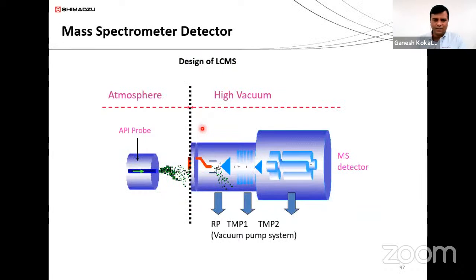Now the last detector is MS. On this detector, I'm not going to talk much today. I will cover the whole detector and whole mechanism and applications in the coming session, I think tomorrow. So I'm just focusing on this mechanism as far as today's session is concerned.